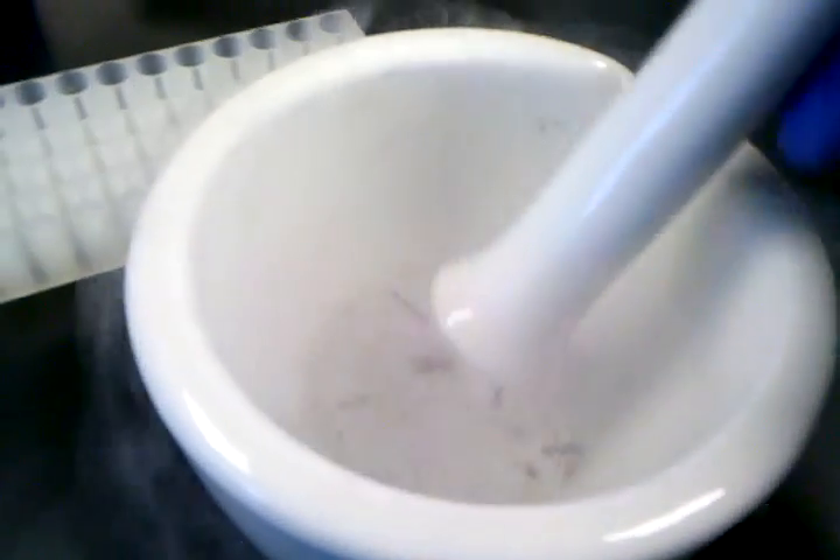That's probably enough. Then wait a few seconds, allowing the roots to freeze. Then take your mortar and gently grind the sample. It'll break into pieces as it has frozen.